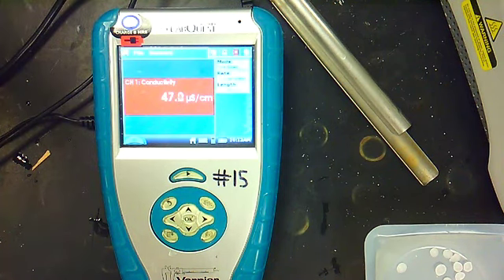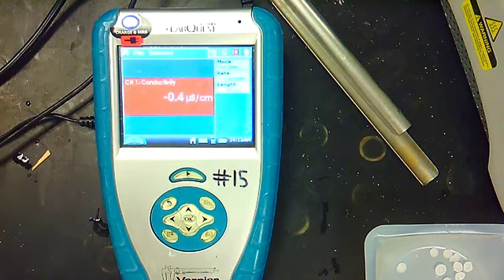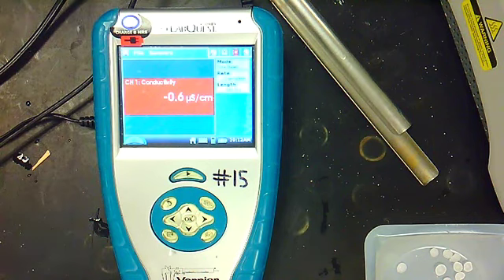Compound C was about 60 something, and this one is about 47. Okay. So, based off of these readings, you should be able to classify your compounds as ionic or covalent, and then go a little bit further and try to figure out which one is polar and which one is non-polar.